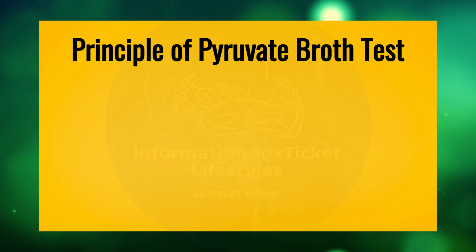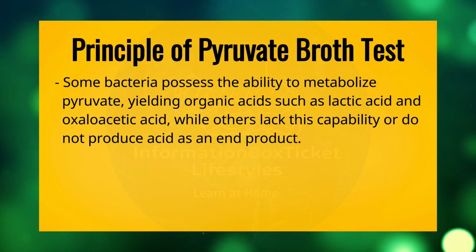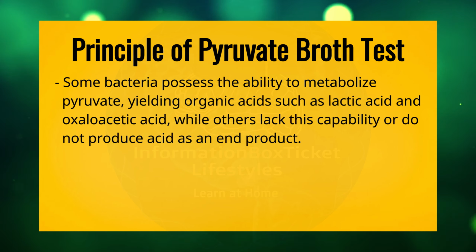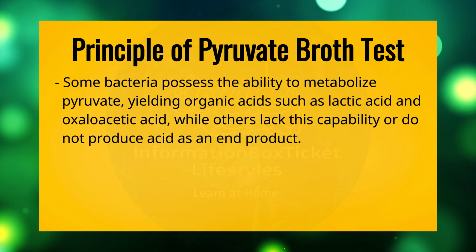Principle of Pyruvate Broth Test. Some bacteria possess the ability to metabolize pyruvate, yielding organic acids such as lactic acid and oxaloacetic acid, while others lack this capability or do not produce acid as an end product.